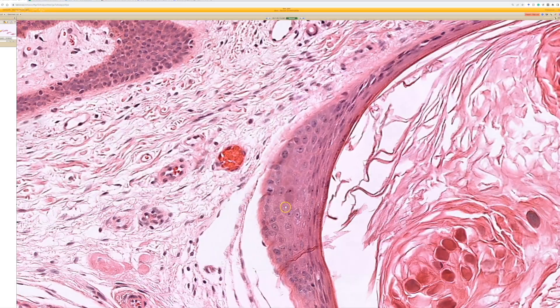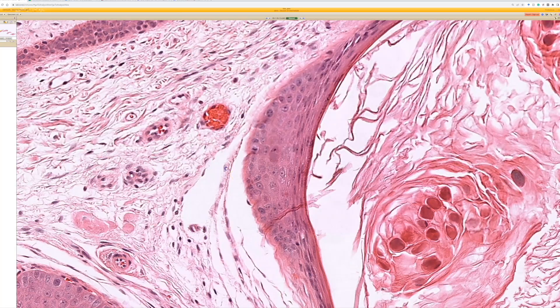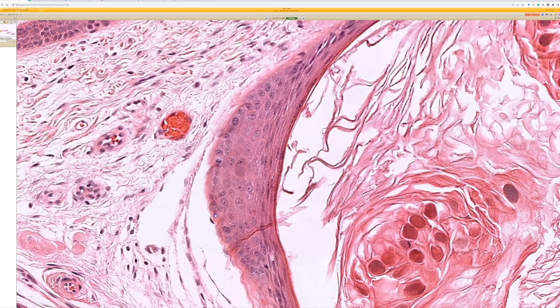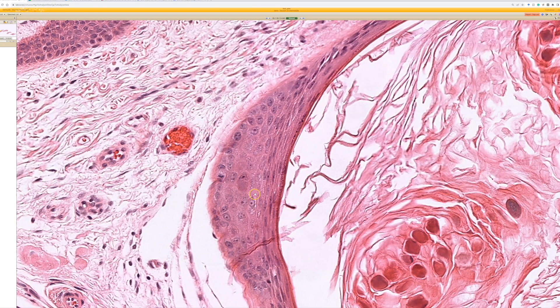Here you can see just one subtle Molluscum change there. Also, depending on where your section is, you might see just the subtlest hint of keratinocytes that are getting large with a kind of expanded pink cytoplasm.